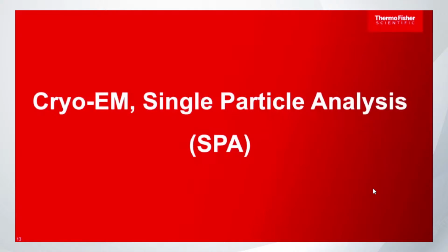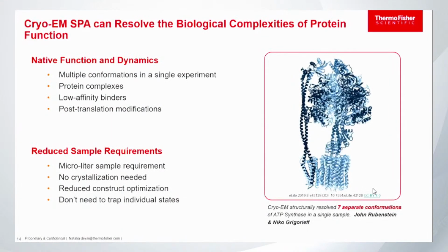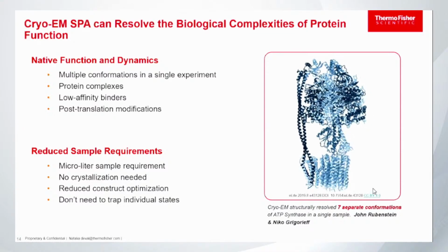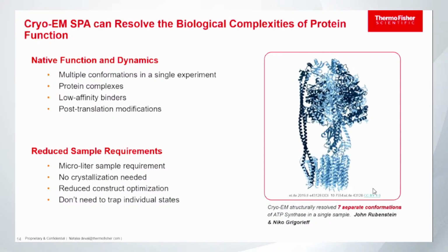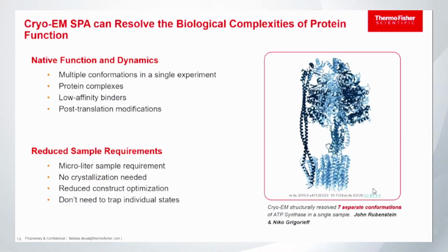For people who are a bit more adventurous, or who need a bit more resolution, you need to go for cryo, okay? Because cryo-EM is the way to go to visualize your proteins almost in a native context, without any artifacts coming from the fixation and dehydration process. So that's very, very cool. The first thing is cryo-EM single particle analysis. Again, as I said before, you need to express and purify the protein of interest, so it's ex situ, and you need to be able to do all the process. I will have another slide later with the whole pipeline for this.